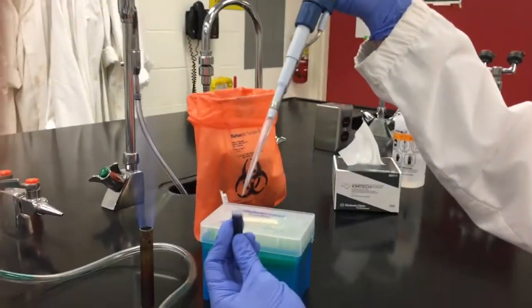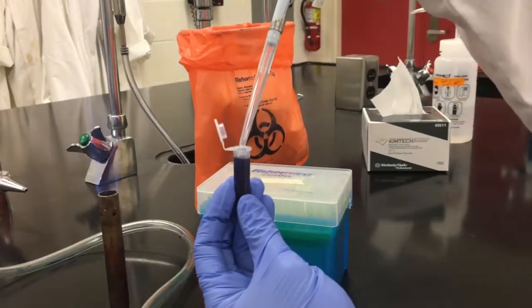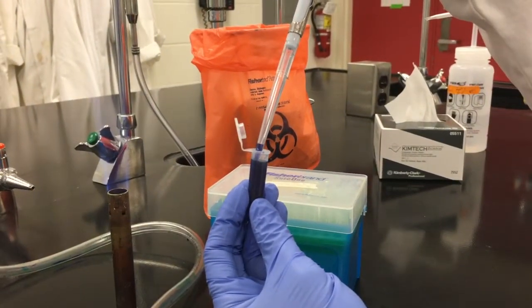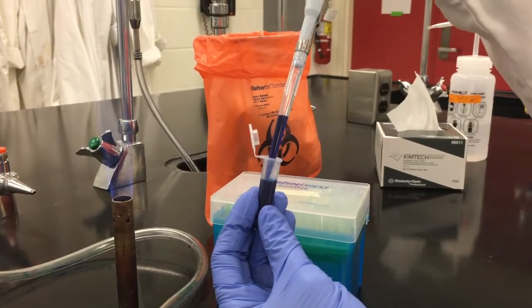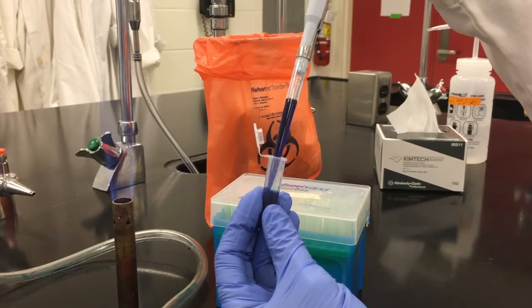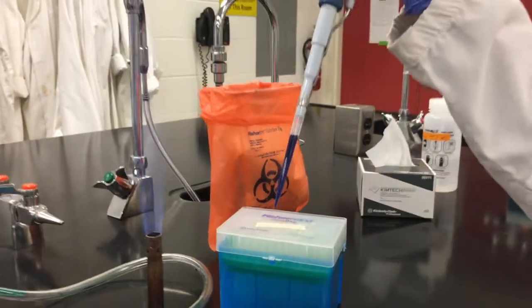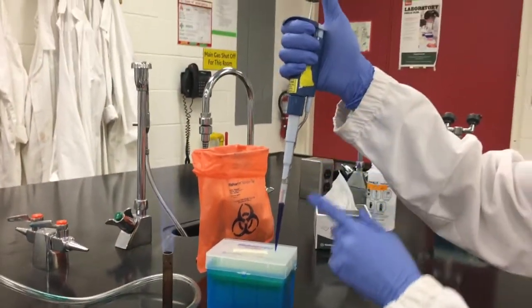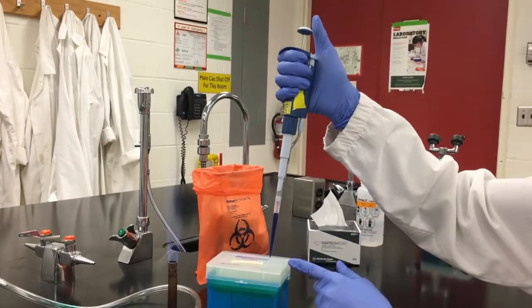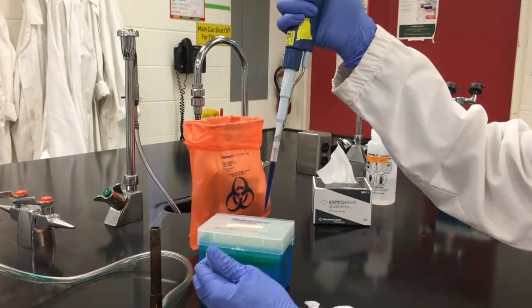Place a minimal amount of the tip into the liquid to be transferred to avoid sample loss to the outer part of the tip. Slowly release the plunger to draw up the liquid. Fast release of the plunger can cause air bubbles resulting in inaccuracy or splashing of the liquid into the pipette resulting in contamination and damage. Again maintain the pipette in an upright position so no liquid gets into the mechanisms of the pipetter.